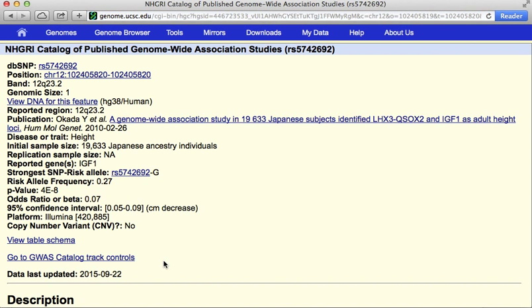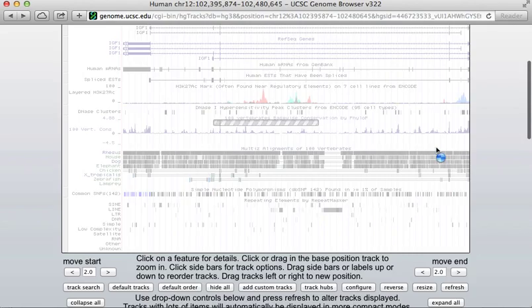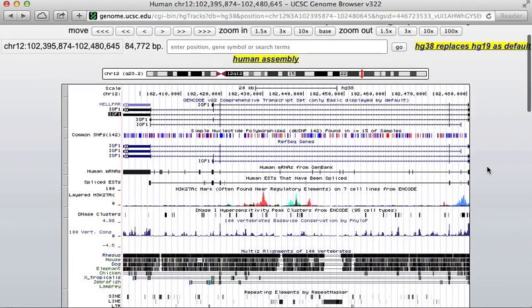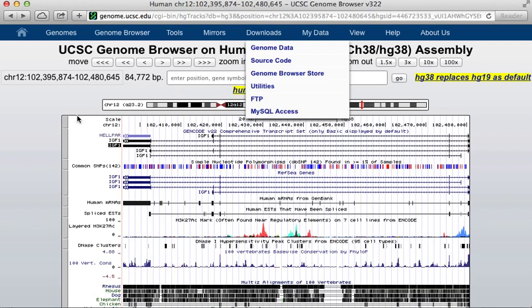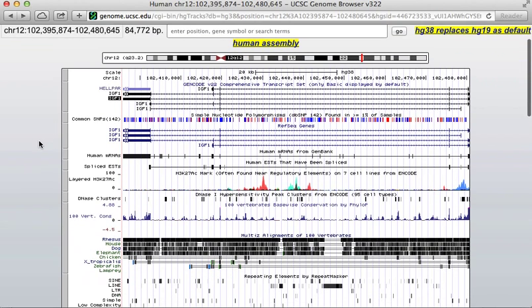There's a single SNP in this region. I can click on that to get more information about it. It shows me that this SNP was found in a genome-wide association study of 19,633 Japanese subjects. IGF-1 was found as an adult height locus. That is an overview of the genome browser. As I said, there's much more to discover here, but you can click through the help buttons, and there are many tutorials online. Also, just clicking on things is a good way to find out what they do. This is just enough to get you started. Good luck!